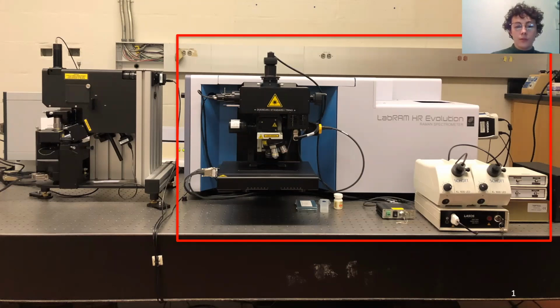To use the instrument, you place your sample here on the motorized stage. There, the sample is irradiated by one of the 3 lasers, and the backscattered light is then collected through the confocal optics and directed towards the detector over here. This results in Raman images with a spot size limited spatial resolution of around 2 microns.